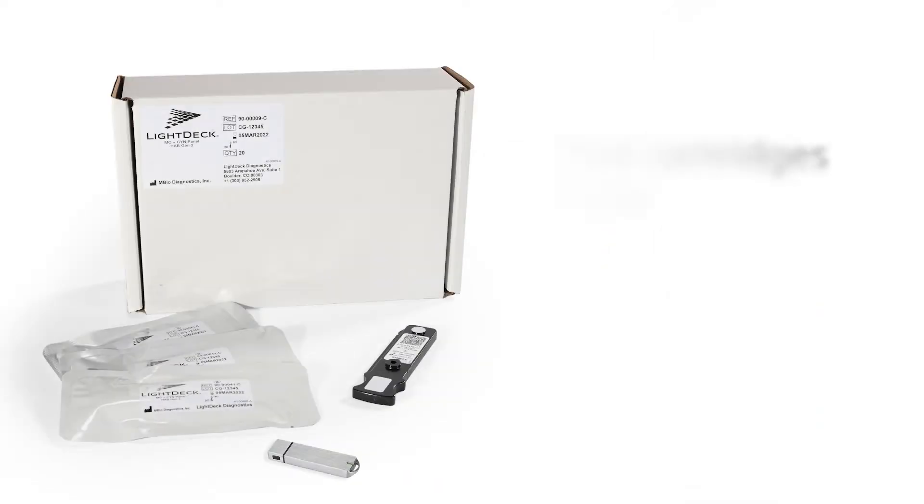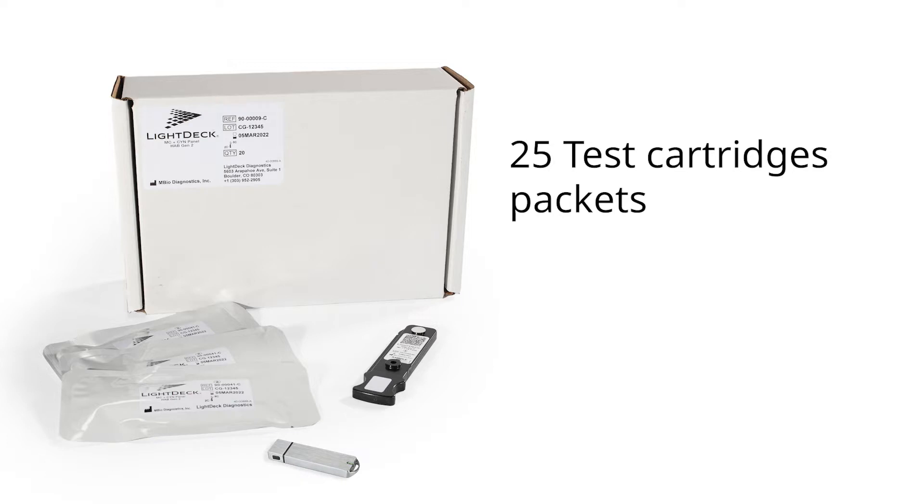The LightDeck Mini ships with a 100 microliter fixed volume pipette and 28 disposable pipette tips. Each box of disposable test cartridges includes 25 test cartridge packets and one USB flash drive that contains a definition file for the cartridge lot.